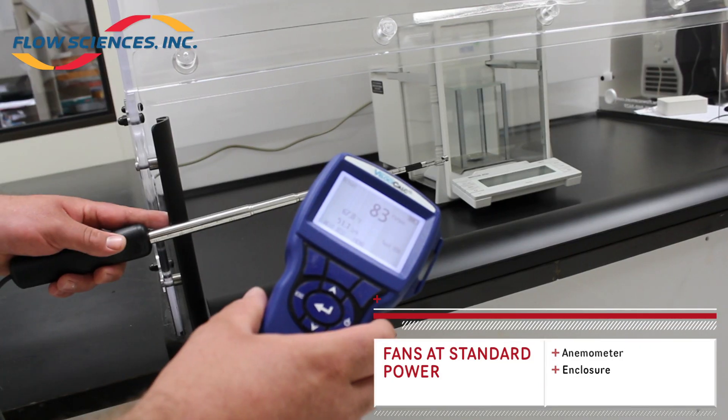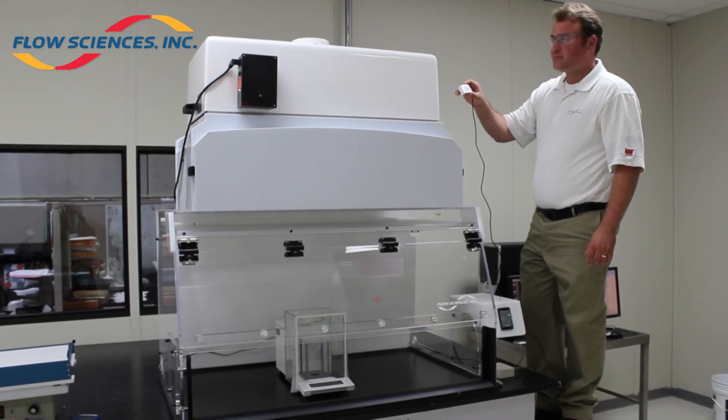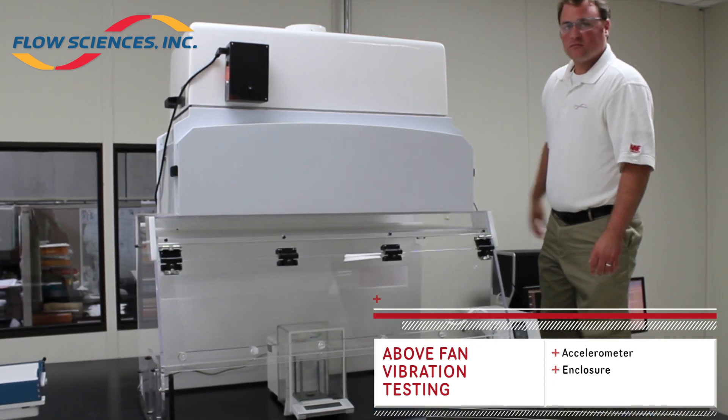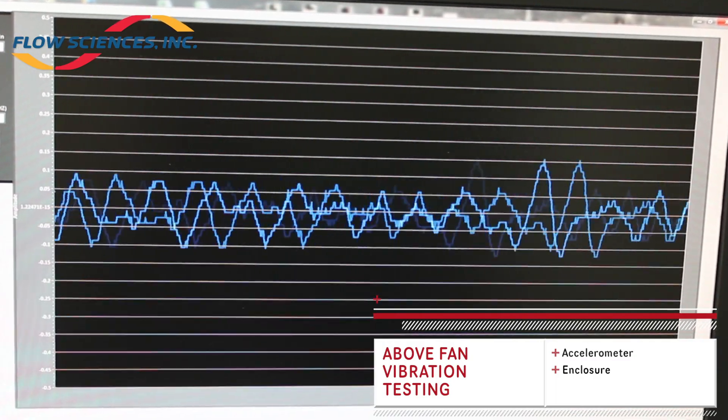Test 3: The fan was set to maintain a standard face velocity. The sensor was placed on top of the fan unit. This was to determine what vibrations are created by and present at the fan unit on top of the enclosure under normal operating conditions.